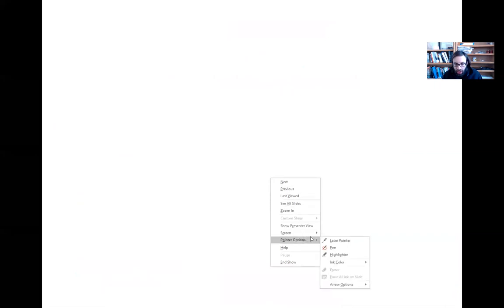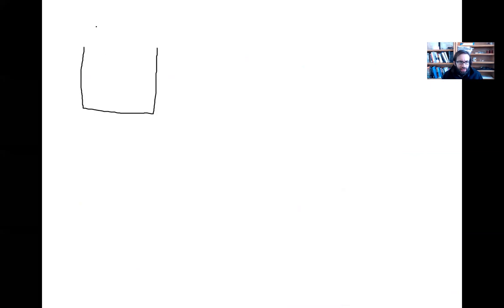And so to summarize, I think it's just helpful to draw this out a little bit. What we're going to think about is our three-electrode cell. Okay, so we have 3 electrodes in here. There's some solution, right? I'm going to give them abbreviations. I'm going to call this W for working electrode. That's what we're studying. I'm going to call this R for reference electrode and C for counter electrode. And so let's say we're doing an oxidation at the working electrode. So we have some material on here and it's getting oxidized.